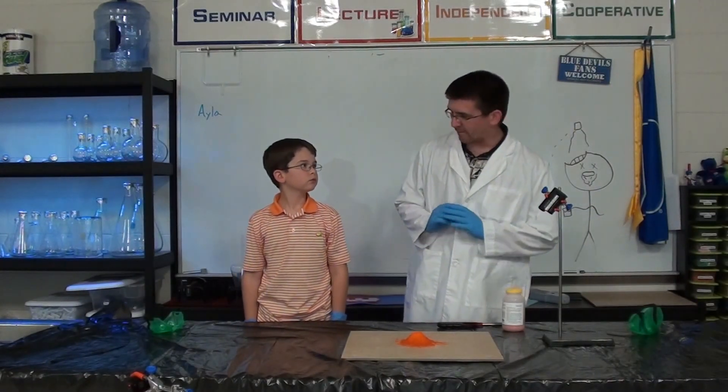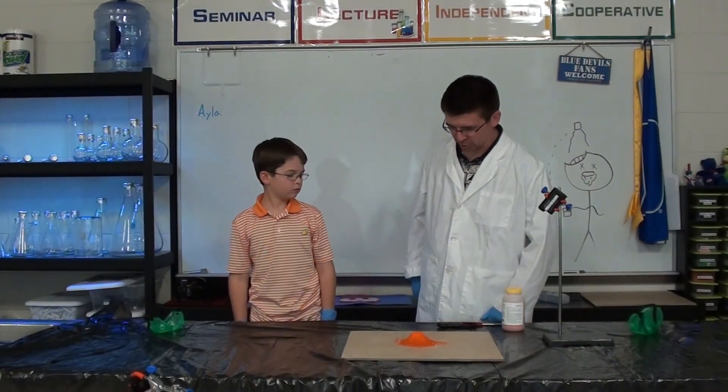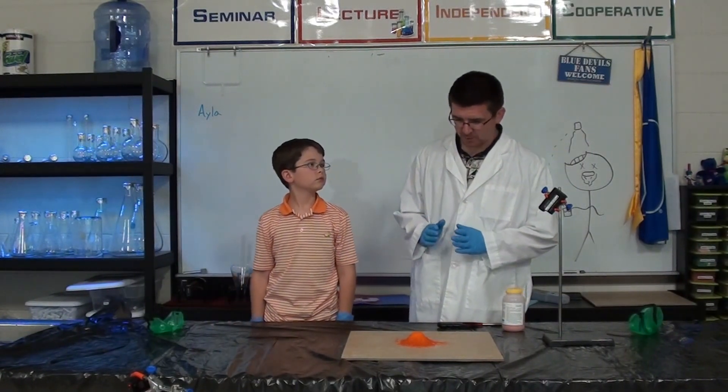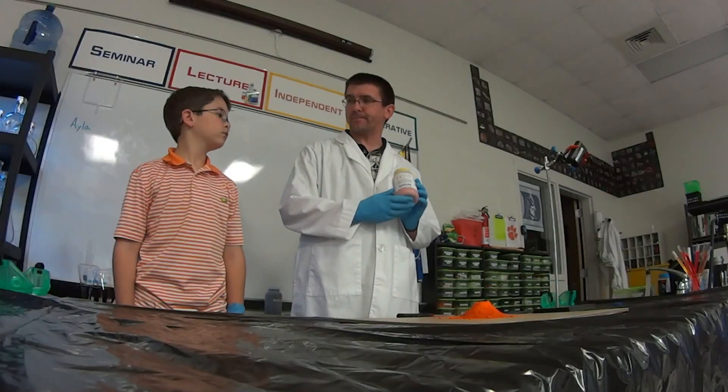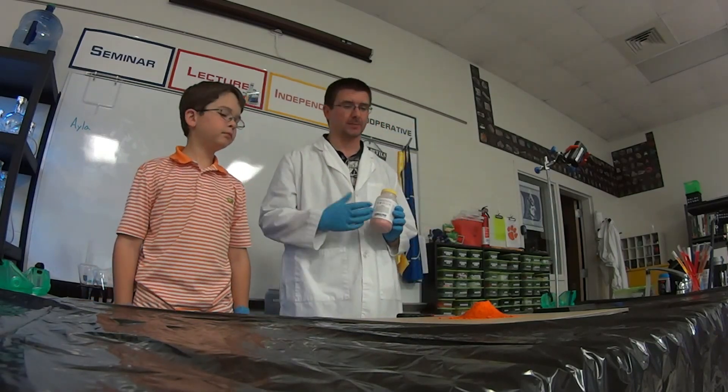Right now what we're going to look at is one of my very favorite chemical reactions. It's a bit of a decomposition, oxidation reaction. And it takes place with a chemical called ammonium dichromate, which is this bright orange powder that we've got a pile of on the table in front of us.